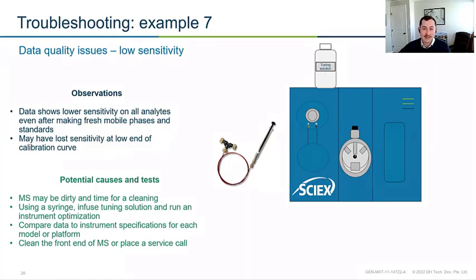If it's more dirty than that, you might have to do a little bit of disassembly, or if you're uncomfortable doing those types of front-end cleanings, you can just schedule a service call and they can get it sorted for you pretty quickly. But having that infusion tool and a known solution, whether it be your tuning solution, is really key here, because that's going to identify that, yes, the problem is the mass spec, and more than likely, it just needs a cleaning.